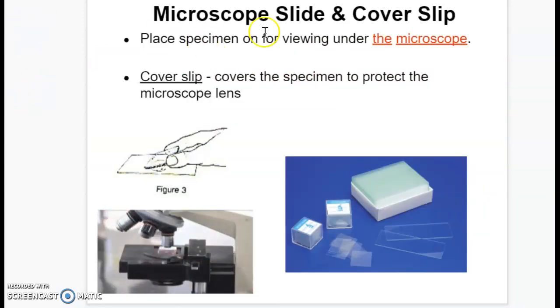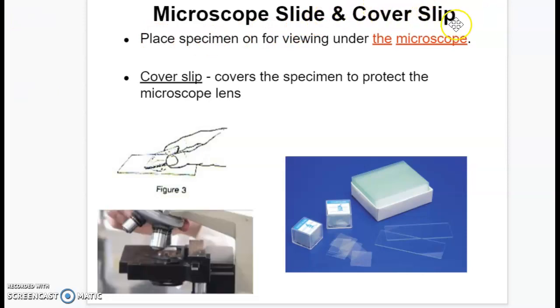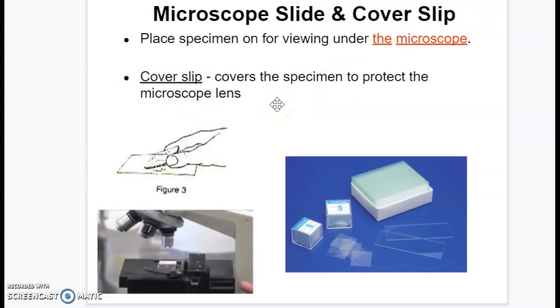Next, we have microscope slide and cover slip. Now, the cover slip is not on your notes page, but you could always write it in that extra area you have in that box.